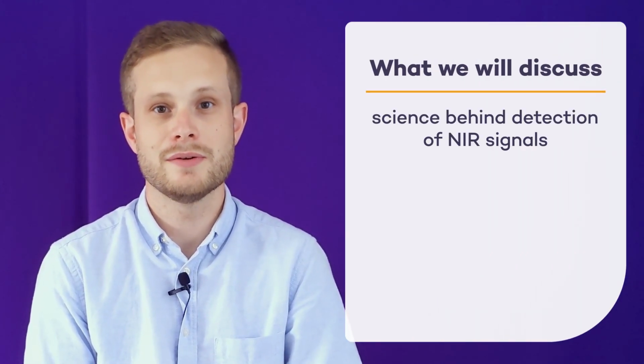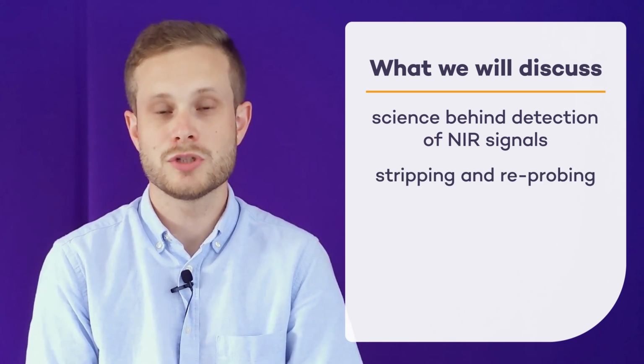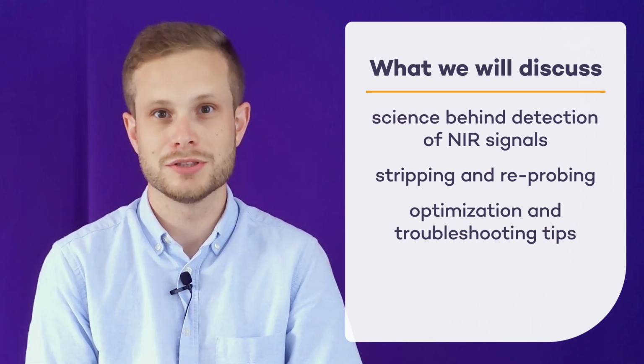My name is Andy and I'm a Solutions and Support Scientist at LICOR. In this course, we're going to be discussing the science behind the detection of near-infrared Western blot signals. We'll also cover the option for stripping and reprobing the blot, and we'll finally go over some optimization and troubleshooting tips. Afterwards, my colleague Jessica will go over some advice for best practices, and lastly, Sally will show you how it's all done in the lab. With all of these tips, you'll soon be an expert in near-infrared Western blot detection.